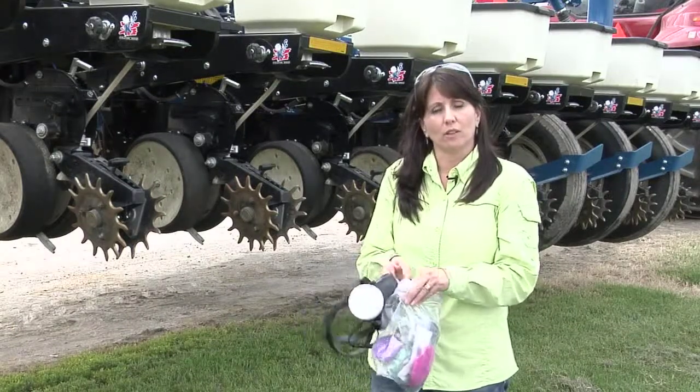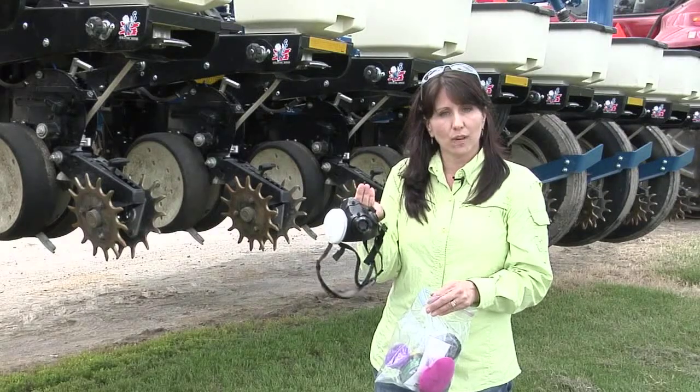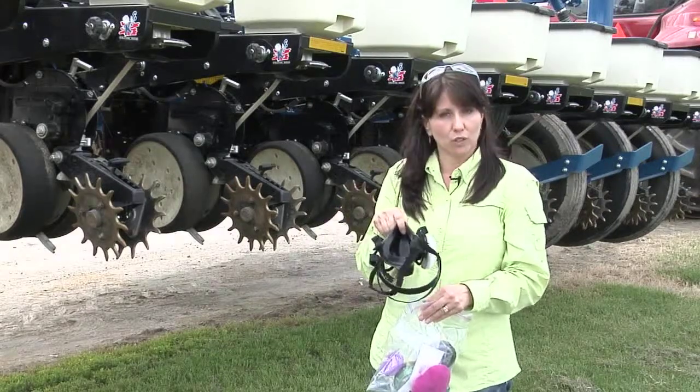So the big message for a respirator that looks like this is: only use what you need to, make sure you get the right fit, and do not use it if you don't have to.